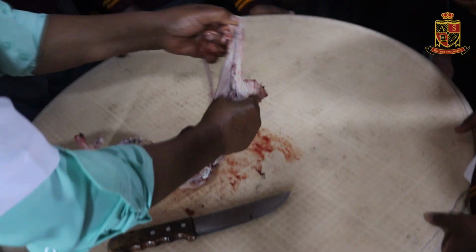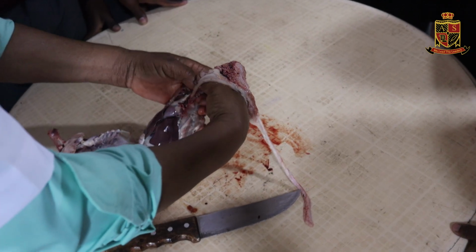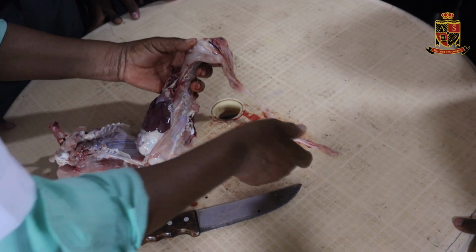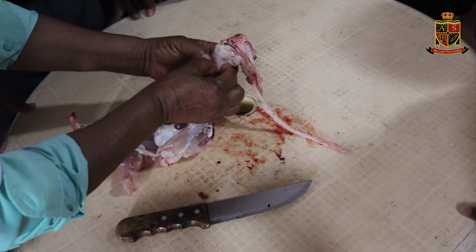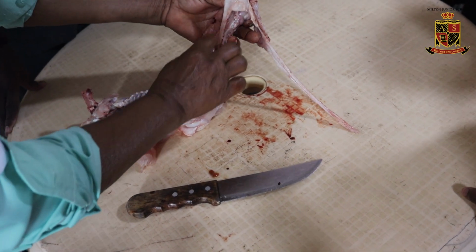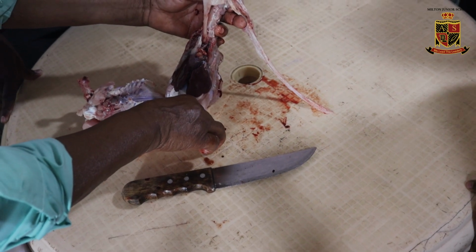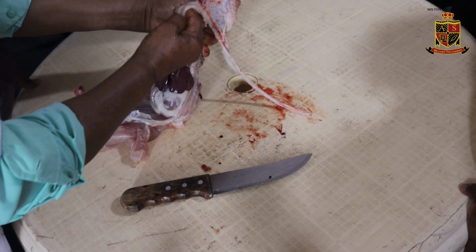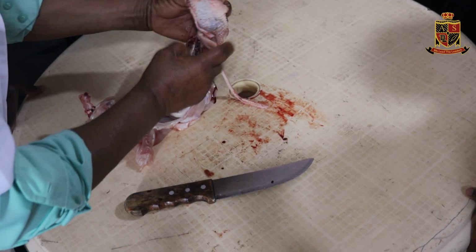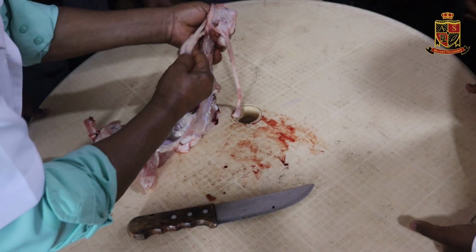Though the chicken is quite different from humans, isn't it? Yes. But do they chew? They don't, they just swallow, isn't it? Yes. So this is the pipe which is known as the esophagus. When they eat, the food passes through this, and from there it doesn't have any food at all in where it is supposed to.